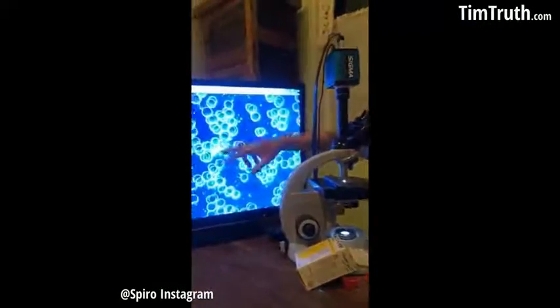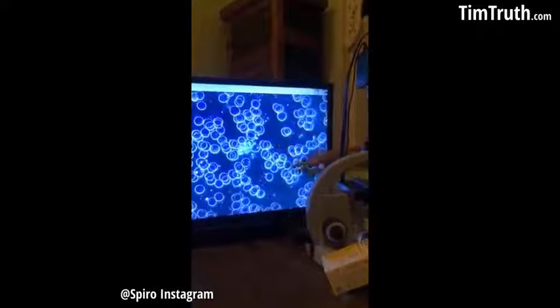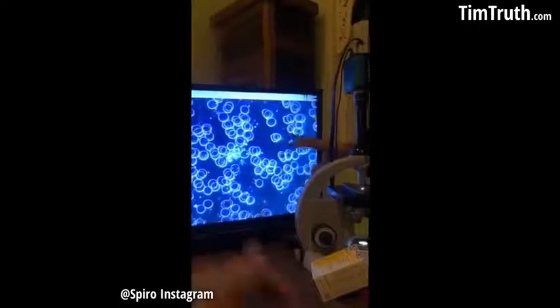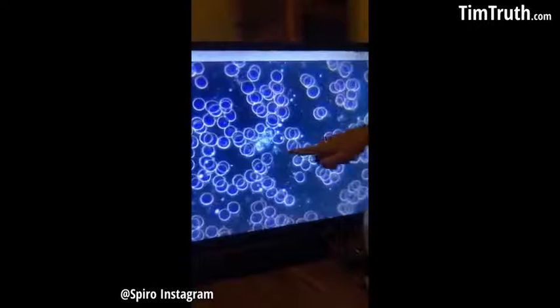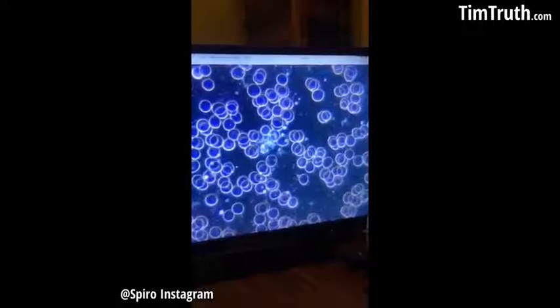Yeah, this is a dark field microscope, so we can actually do live blood analysis with this microscope. We can take the blood and look right away under the microscope, and you can see these things are still alive. They're all microorganisms, they're moving around, so this is all healthy microbes. They're very important to have in the blood. These are our red blood cells, and we're aiming here that they're really round and separated, one by one. These are the white blood cells, the leukocytes, and you can also see there is movement in the cell, which is really important, that they're active. So this is important to see.